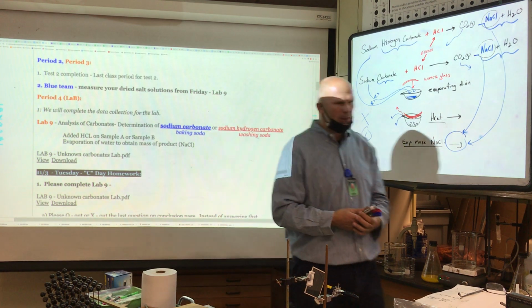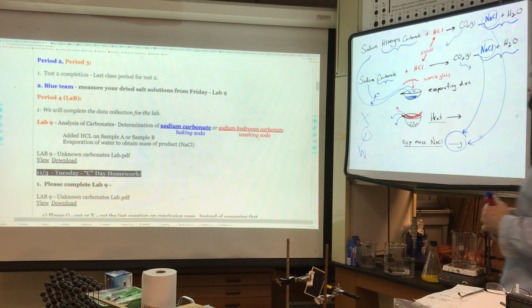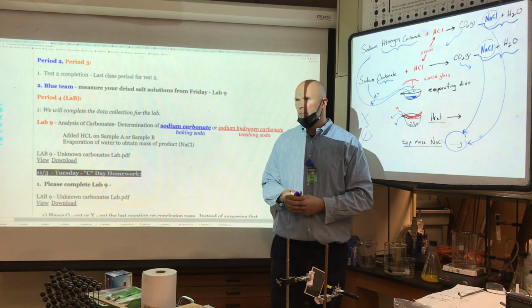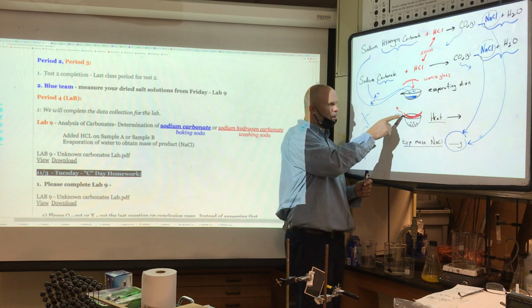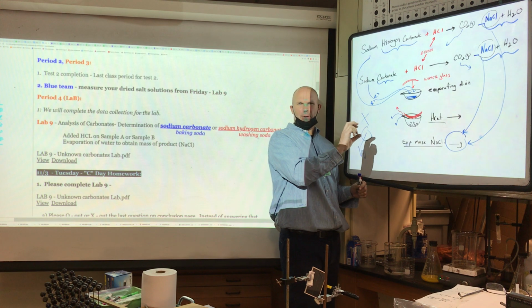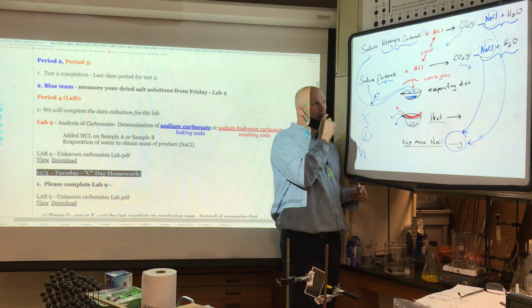And that, my friends, is all the instructions you need for the lab. I do suspect that your percent yield will be below 100, okay, because of loss of some of the splattering, because we're going to heat pretty violently. If we were doing this over a 2-day period, I just put it on 50 and it comes back nice. So we're going to get this done today, all right?